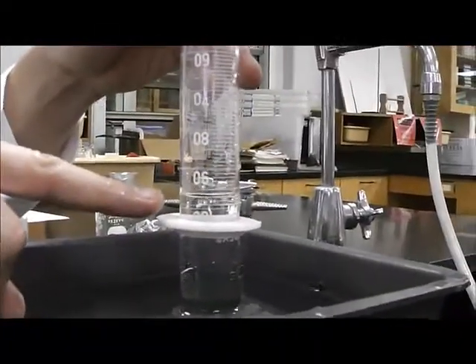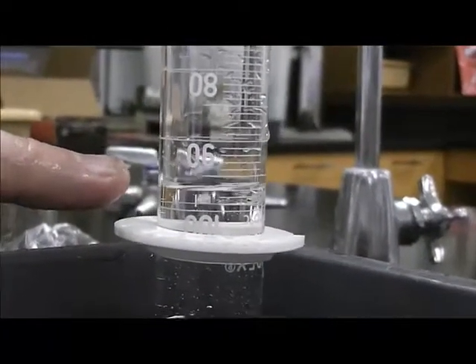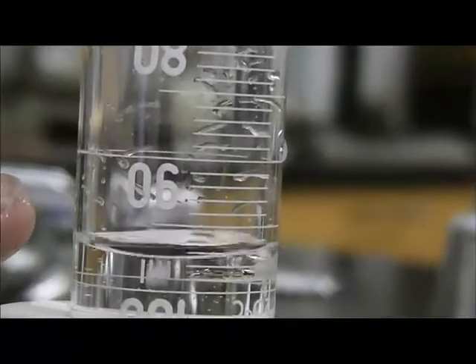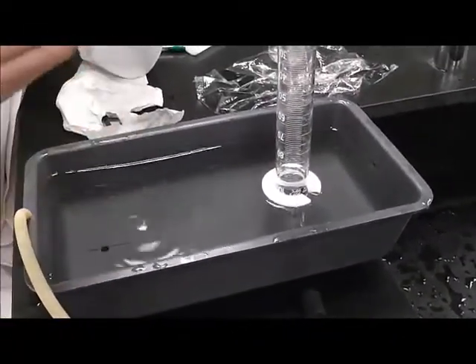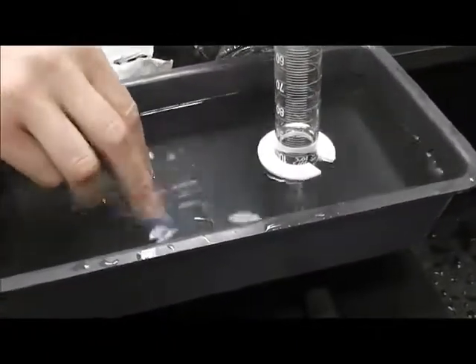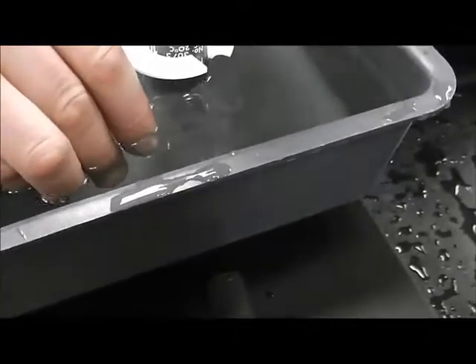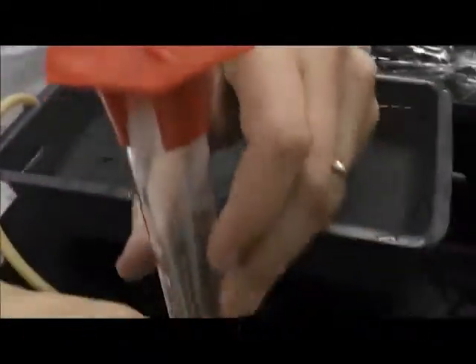I'm going to try and read how much gas I currently have. Now remember, you're inverted, so you have to pay special attention to exactly where those numbers are. If you are having a difficult time reading, here's a neat trick. Take the 50 ml beaker, put it in, and make sure there's no air inside the beaker. If you do this right, it's going to work beautifully. You need to tilt it and not lose any air bubbles. If you can set that up, you can pick the whole thing up and read it easily.